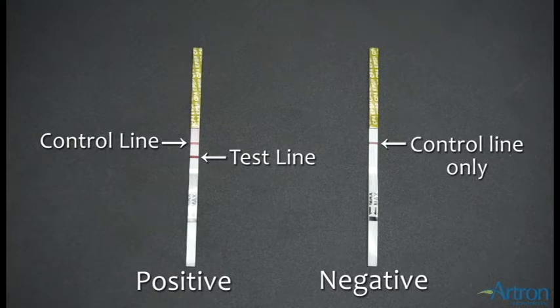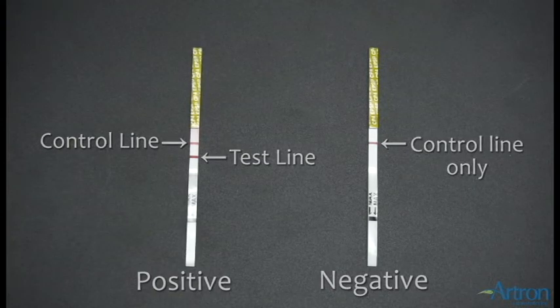The test strip on the right displays a negative result with the presence of a control line by itself.